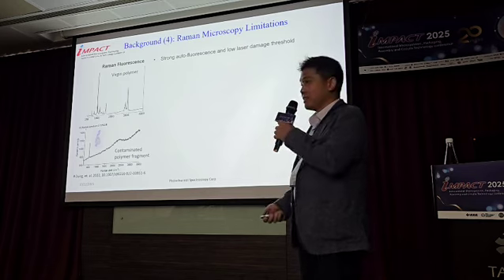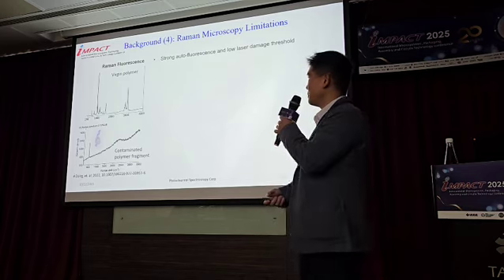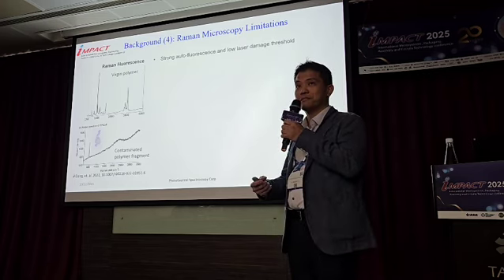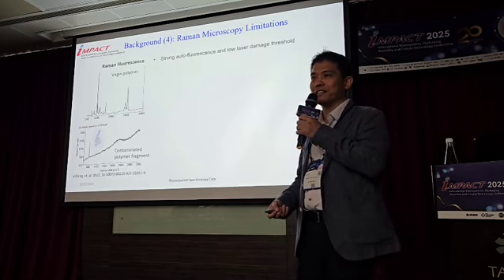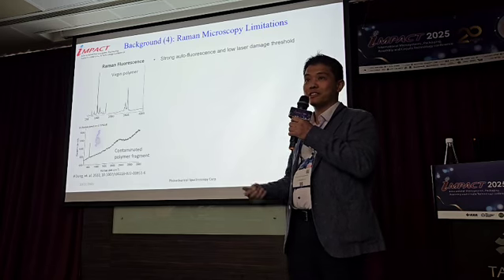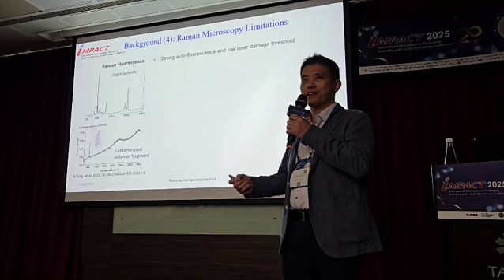All right, so there are alternatives. For instance, we have Raman spectroscopy, and it does provide very high spatial resolution, but as a side effect, it has this autofluorescence baseline that we commonly see, in particular for semiconductor and microelectronics packaging, because most of those materials fluoresce very strongly.